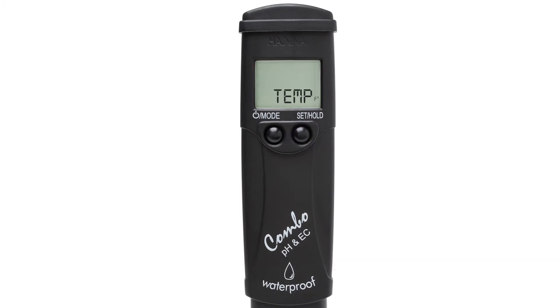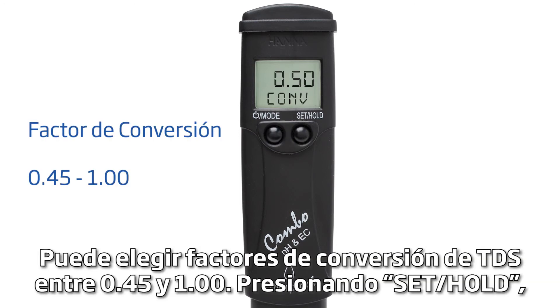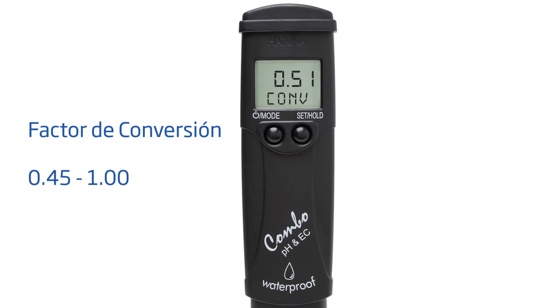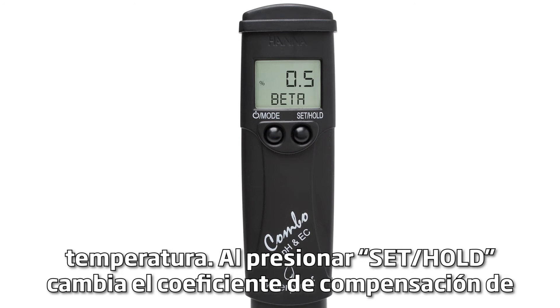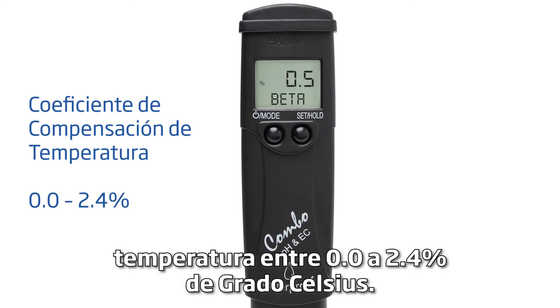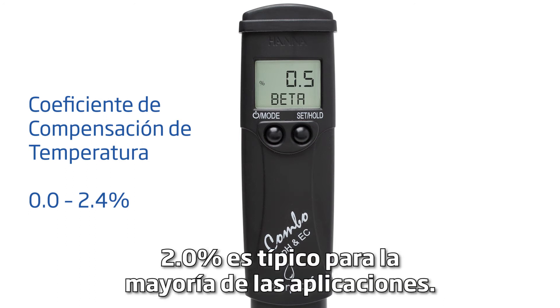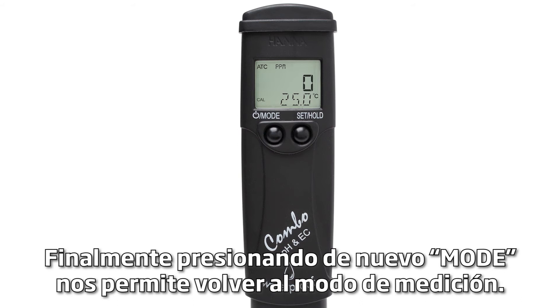Choose the units you prefer. Press MODE again to change the EC/TDS conversion factor. You can choose TDS conversion factors between 0.45 and 1.00 by pressing SET HOLD. The third setting we can change is the temperature compensation coefficient. Pressing SET HOLD changes the temperature compensation coefficient between 0.0 and 2.4% per degree Celsius. 2.0% is typical for most applications. Finally, pressing MODE again allows us to return to measurement mode.